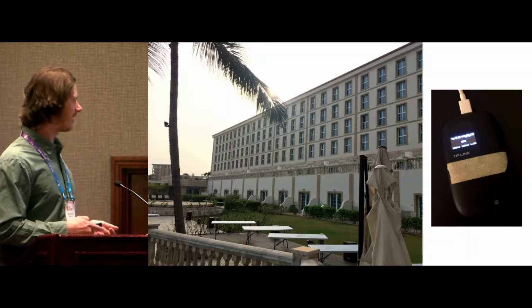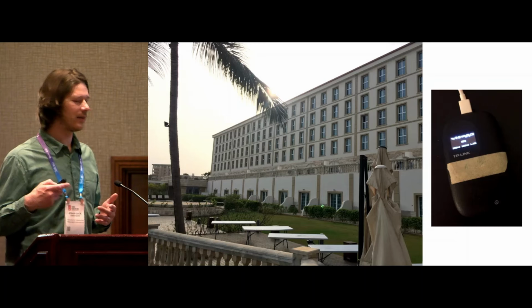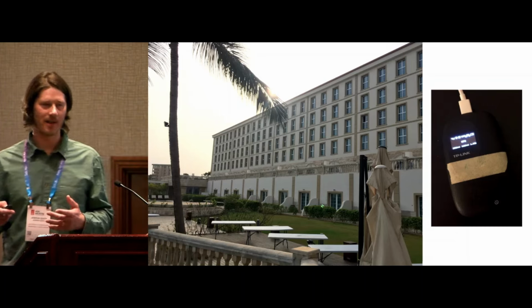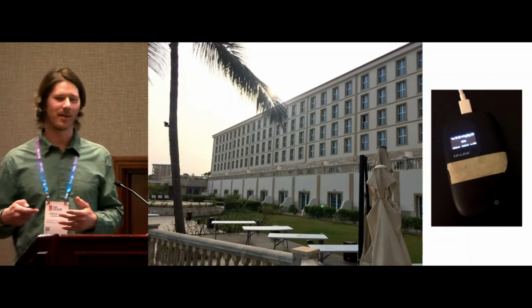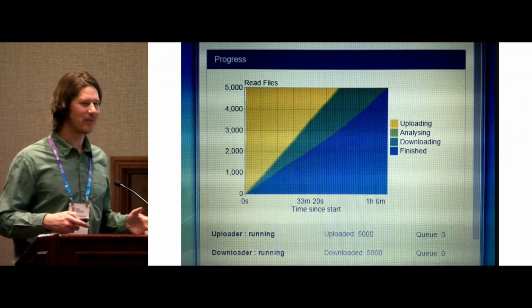So obviously, back then there was no local base caller. So I used to do the sequencing run, get about 500 megabytes of data, and then go back to the hotel and try to upload it using the hotel Wi-Fi connection. I don't know if anyone remembers this: it's metrichor.exe.